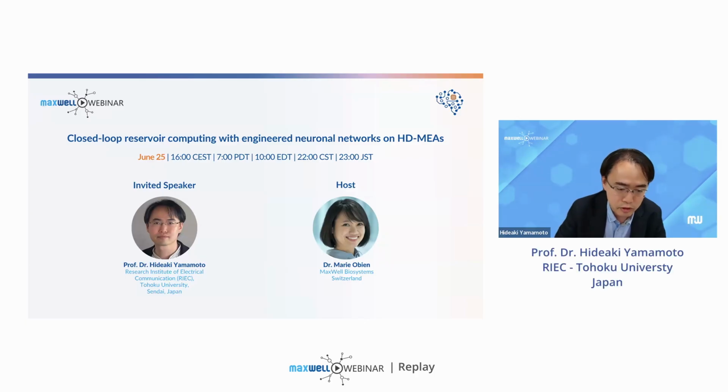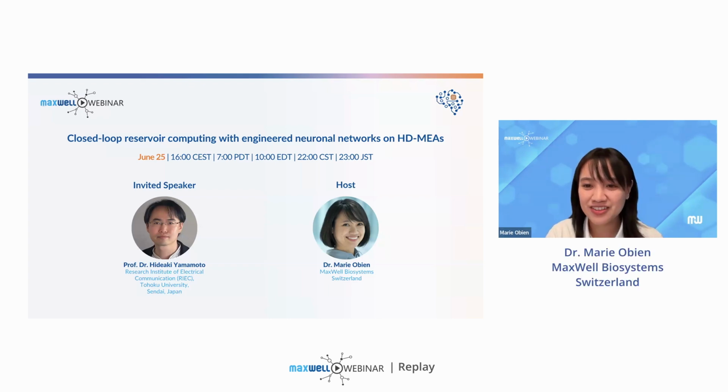No, you're absolutely correct. It's the output layer that is being trained, and there are works that look at training that occurs within the biological neurons. But in my study, we're treating the biological neurons as a fixed reservoir layer. Thank you so much. Next, we have a question from Kalia.